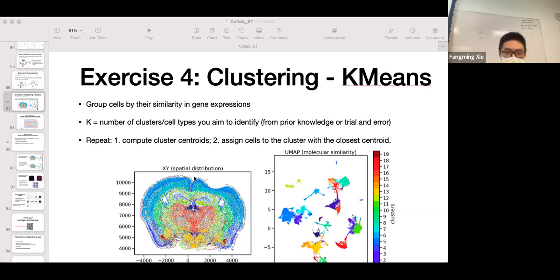I guess one thing I liked about coding is, however hard it is the first time you learn it, you can apply it every time in all cases. So we talked about PCA, we talked about UMAP, we talked about k-means clustering. When we are learning it, it takes a lot of trial and error, and you need to generate lots of lines of code. Once you get it, it's very simple. So actually, I summarized all three things in 3 lines of code.